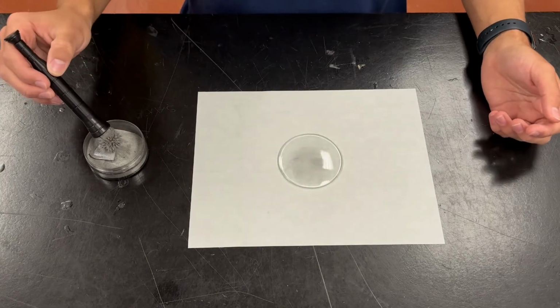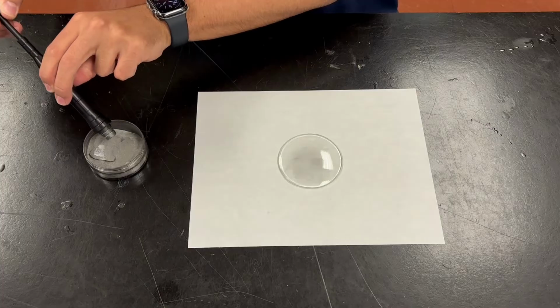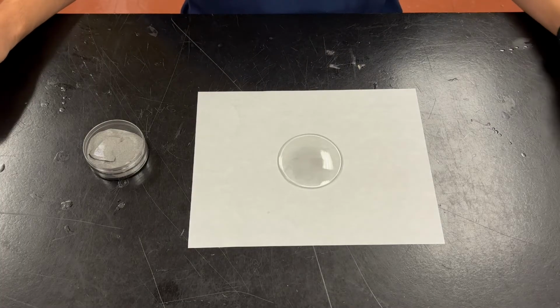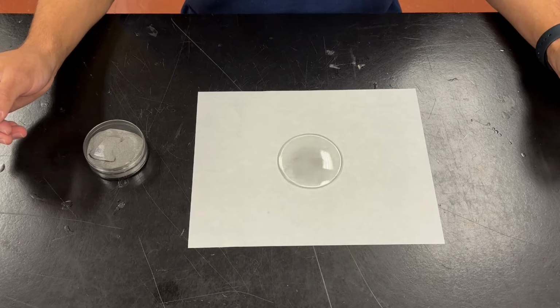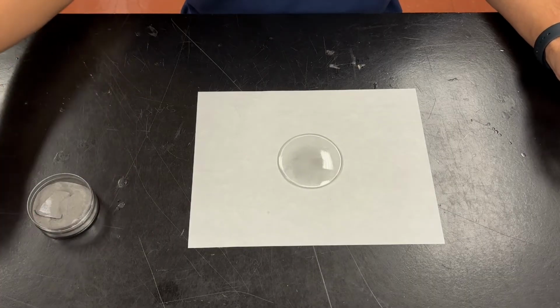Don't let that light appearance of the powder fool you. Unlike the charcoal black powder in our first video, that gives you a cutesy black fingerprint, magnetic powder always turns out lighter simply because iron has more of a dark gray tone. But this is just fine. Do not go back to add more powder. This fingerprint is ready to be collected, and we are going to do so using the same technique we used last time. This is a delicate process. For that reason, before a print is lifted, it should be photographed with scale, just in case.